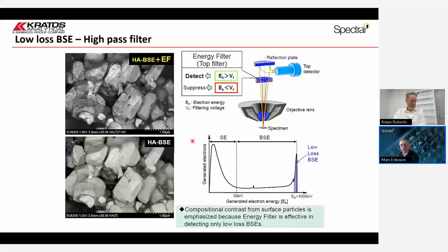It's a nice example of how we could match what is done in the SEM. On the other part of the spectrum of electrons in the SEM, when you look at the backscatter electrons, backscatter generation is sometimes a long series of collisions in the material that finally lets a backscatter electron escape. But if you have a lot of collisions, you will also have some energy losses. If we limit the backscatter collection window to only electrons that are truly elastically scattered, that have not bounced around in the material and lost energy, the probability of them coming from the very top surface is really high.